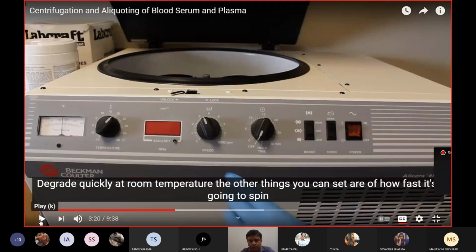In diagnostic labs, usually you won't see such a centrifuge. They're high-end centrifuges which can maintain the temperature. Usually the centrifuge that you will see in most laboratories will just manage the speed. You can see this speed button.